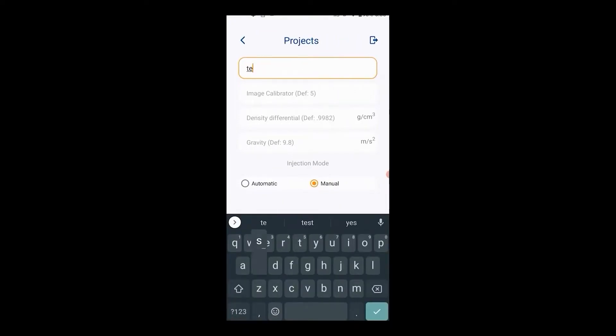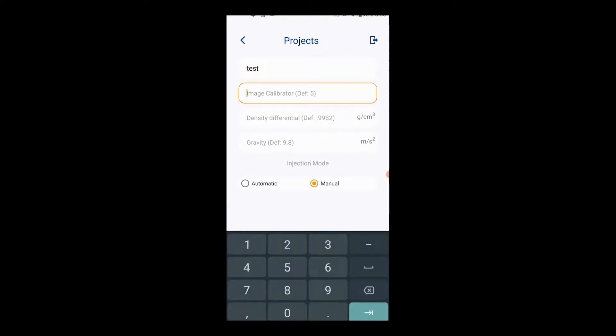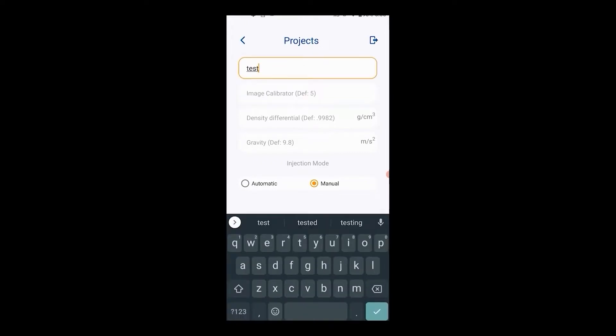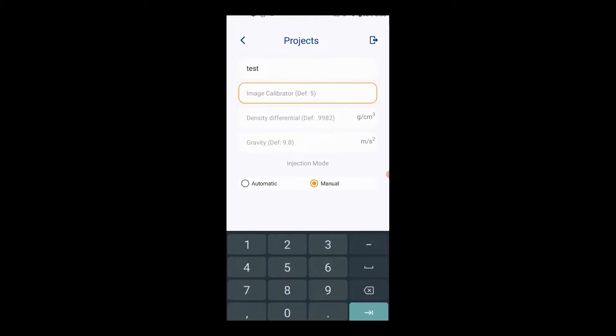Next, the image calibration number, which is the outside diameter of the needle being used in the experiment. We recommend that you measure the diameter of the needle with a micrometer before starting the experiment to ensure proper calibration.